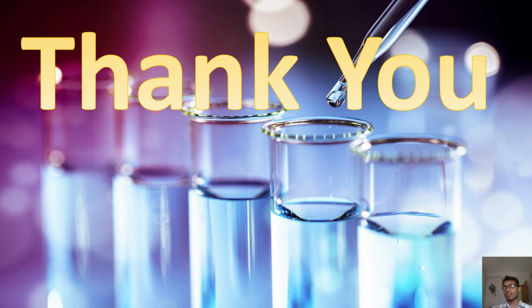This is the overall lecture on liquid-liquid extraction. In this lecture, we have already seen the methods, steps, advantages, disadvantages, applications of liquid-liquid extraction, along with practical implications of this.